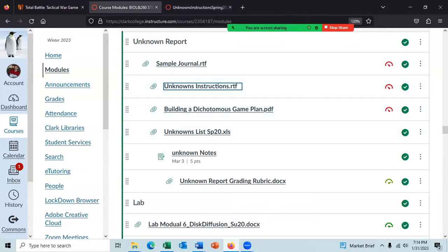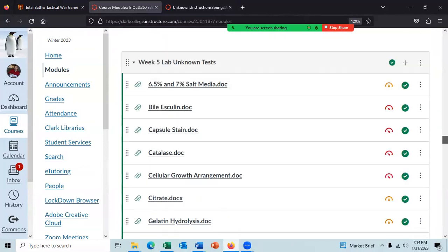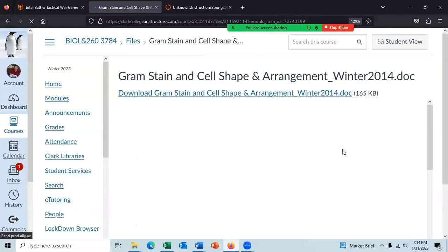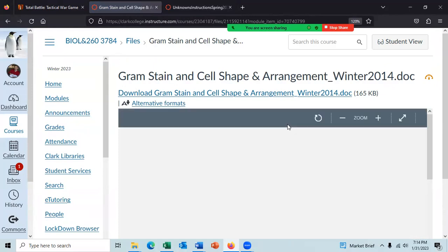So come down here, lab, unknown tests. So you should look at that there. And let's take a look at the gram stain: gram stain, cell shape, and growth arrangement. Come on, load. I'll tell you what it is.